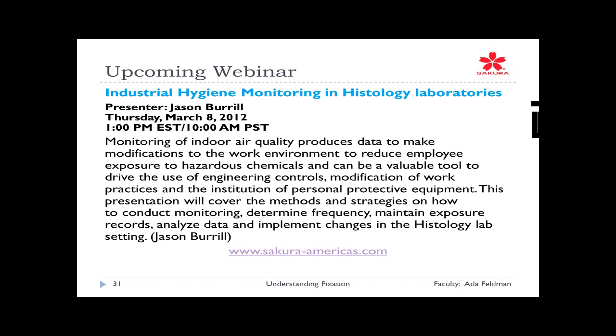I'm going to have to use the Socratic method of teaching by asking questions. First question is, what tissue processor do you have? VIP. We're talking about colon biopsies. I would start across the board, and I don't like using heat, to tell you the truth.